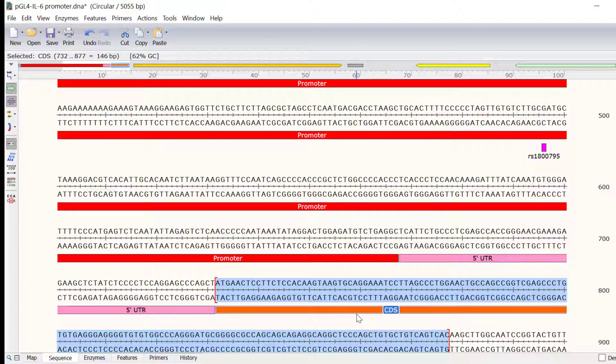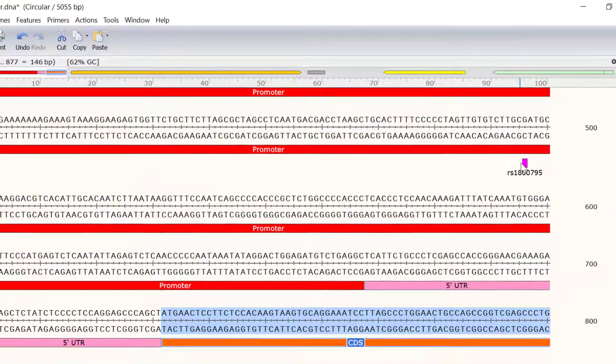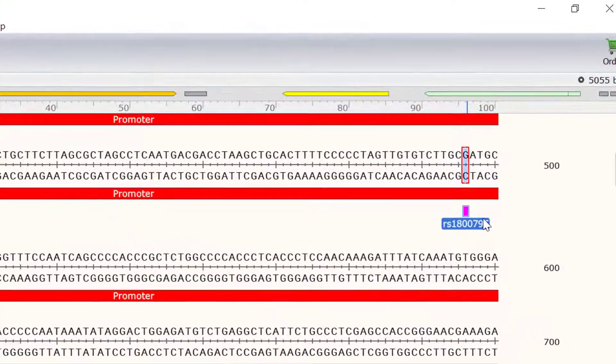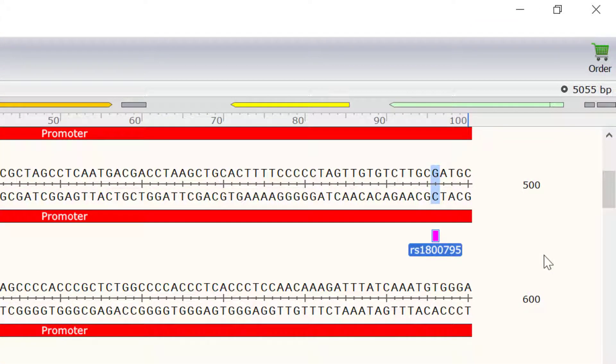Notice I also have a pink-colored feature within the promoter feature, and this is called RS1800795, and it is a clinically important single nucleotide polymorphism for the interleukin-6 gene. At this point, there is typically either a G or a C allele.